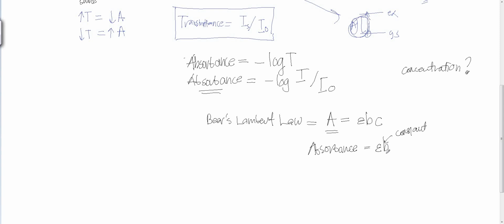And then you have B. What is B? B is the path length of our sample, yang mana selalunya when we talk about the cuvette tadi, okay, kita kena tengok berapa jarak cuvette yang selalunya we are using 1 cm. Okay, so B is the length of the light going through our sample. So you know that because we put our sample in the cuvette, so automatically B will be the length of the cuvette. Okay, kita panggil kelebaran cuvette tersebut.